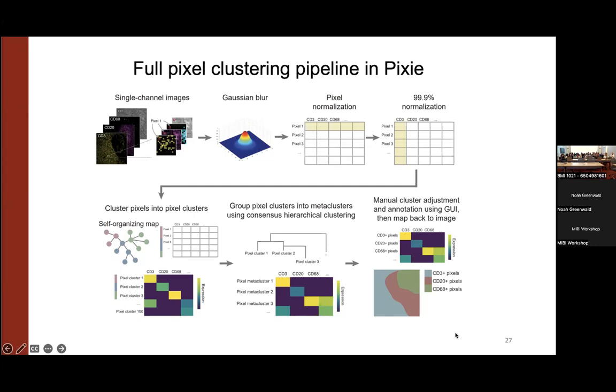It's hard to cluster those pixels, because sometimes one random initialization will be clustered with some other stuff, and another random initialization will be clustered with something different. That's because each pixel is not clearly defined. Increasing the sigma of the Gaussian blur is able to pull out what the true expression of that pixel should be. That's why it helps with the performance of the pipeline, because it makes it easier to classify.